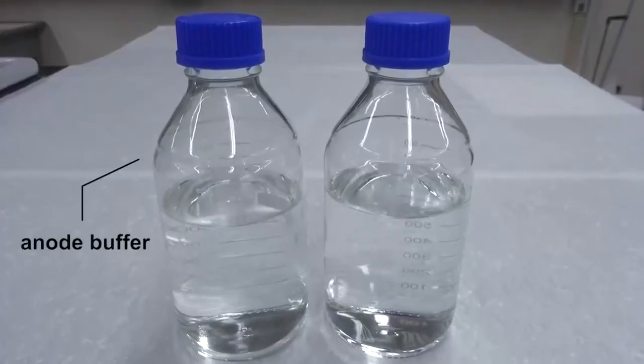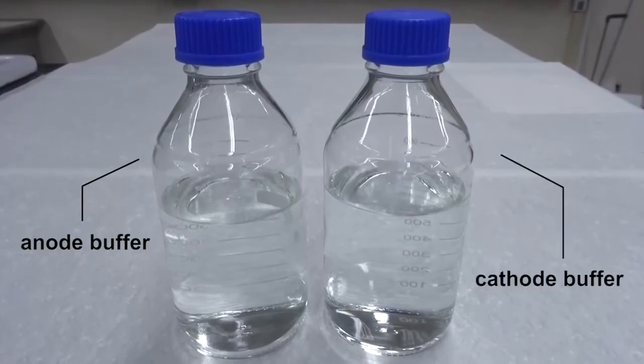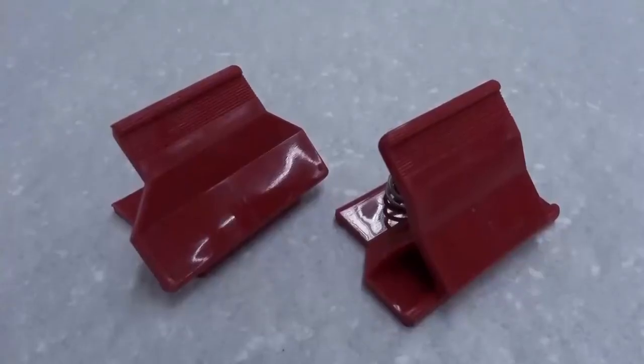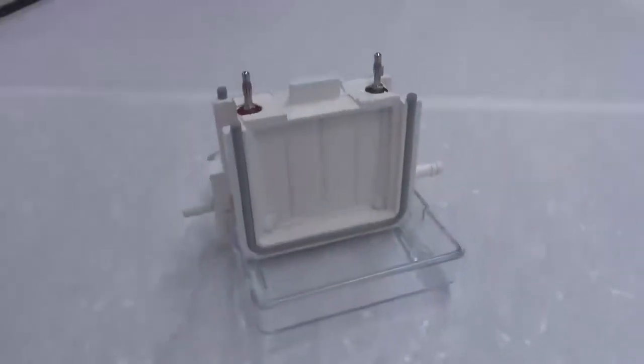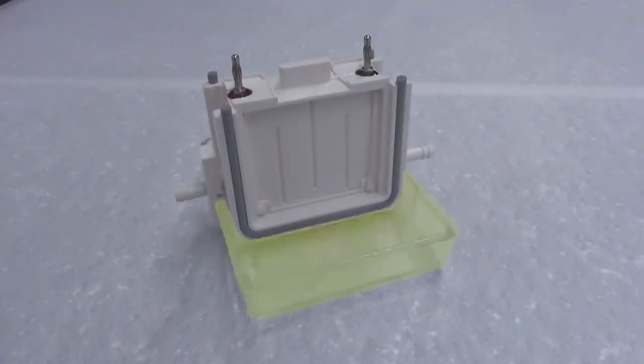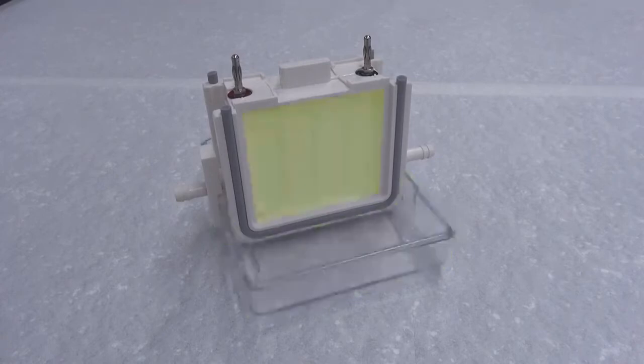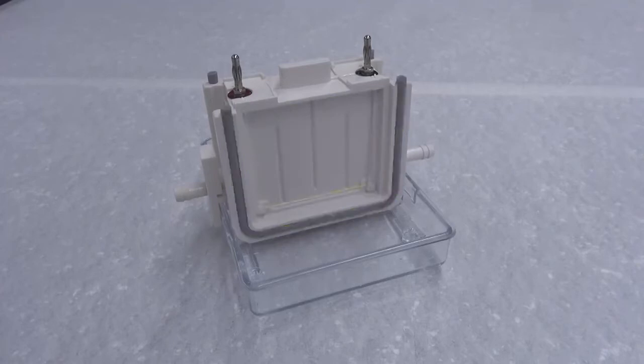Before assembling, prepare the anode buffer and the cathode buffer. You will also need two red clamps, a tank lid, power lines, and an electrophoresis tank. The electrophoresis tank consists of a lower anode tank, an upper cathode tank in which the gel cassette sandwich will be mounted, a U-shaped gasket, conductive platinum wires, and electro-plugs.